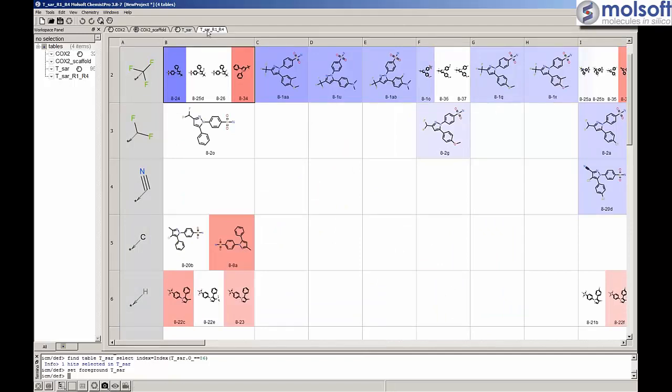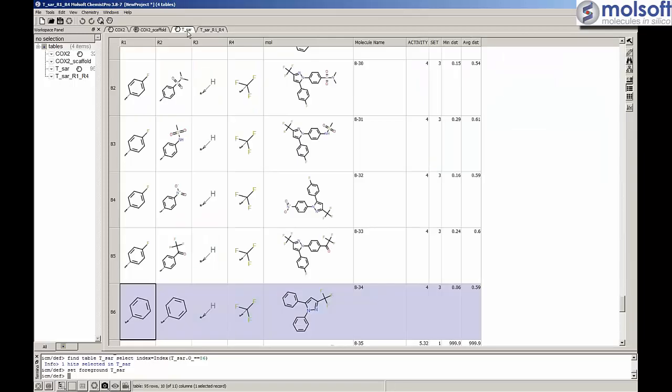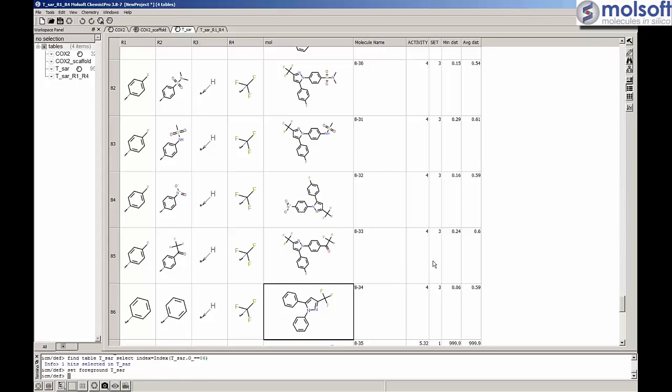That was the first way of representing your data, and the second one is going to be... I already see some questions, I will answer them. Does this suggested pair feature maximize the filling of the R group? Yes, it detects the pair which produces the most variations, so it produces a less sparse table.